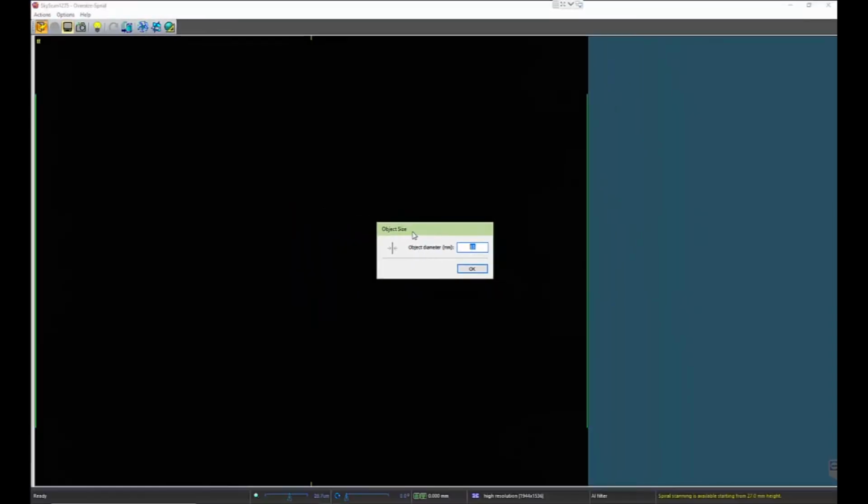It should be something you're using. If you upgrade to version 1.7 and you do not see this feature added when you launch the software and open and close the door, go ahead and get in touch with us here at Microphotonics and we can walk you through the process to enable this step separately from this video.